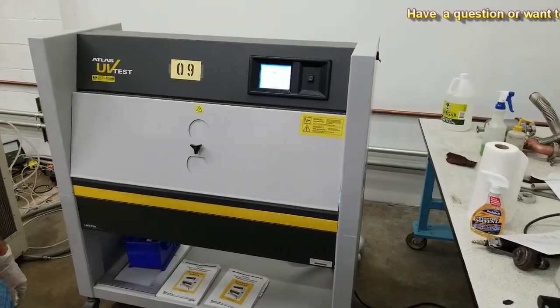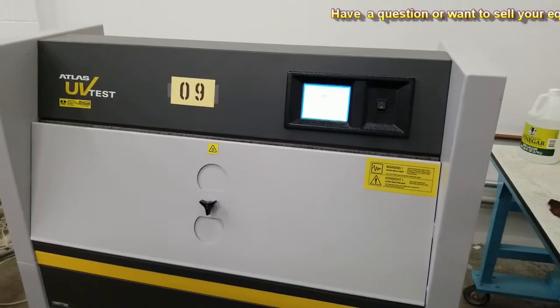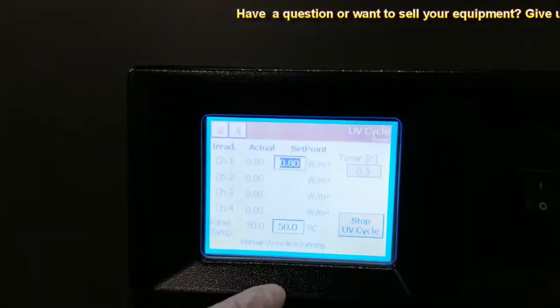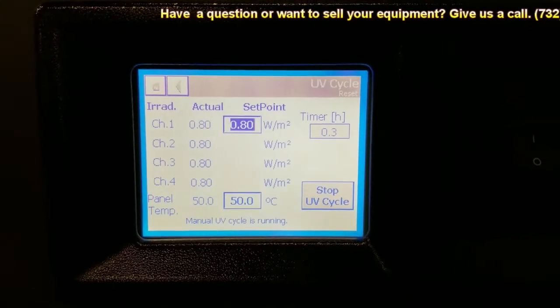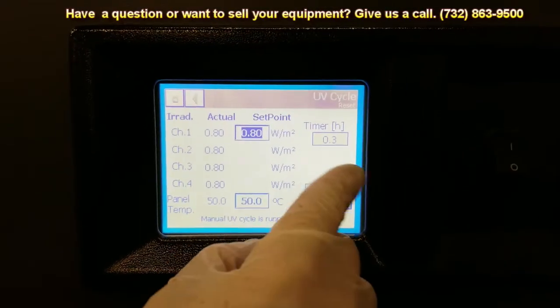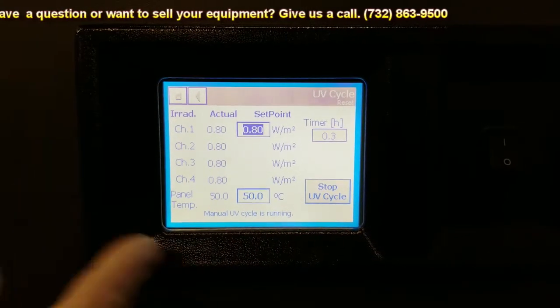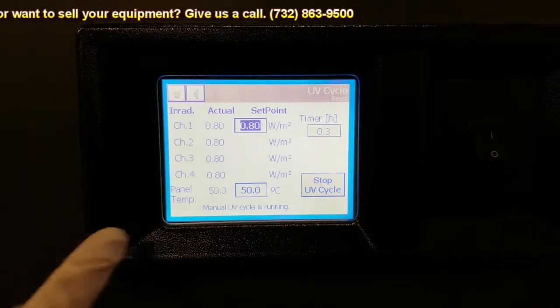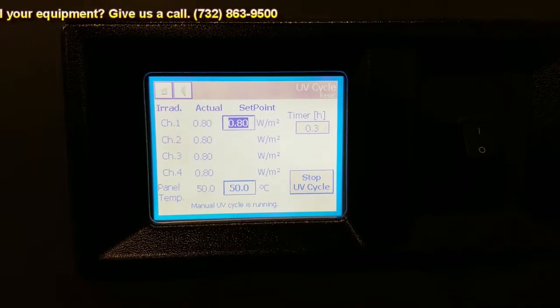This is a video demonstration of the operation of the ATHIS UV test. Right now I'm running it in a manual mode cycle and I have the irradiance set to 0.80 watts per meter square and the temperature is set at 50 degrees. It's been running for three tenths of an hour and you can see the actuals reading what the set point is set for — the same with the temperature. I calibrated the temperature as per the manual.